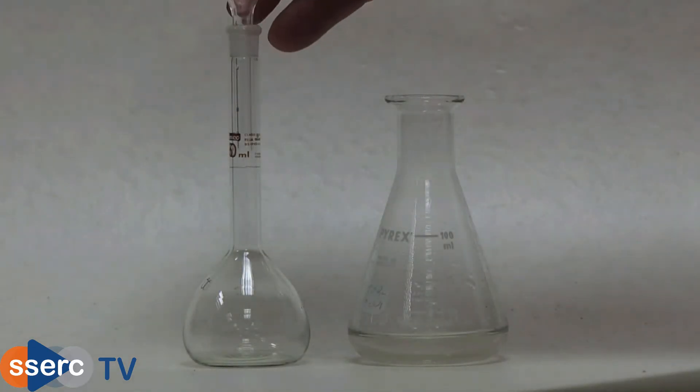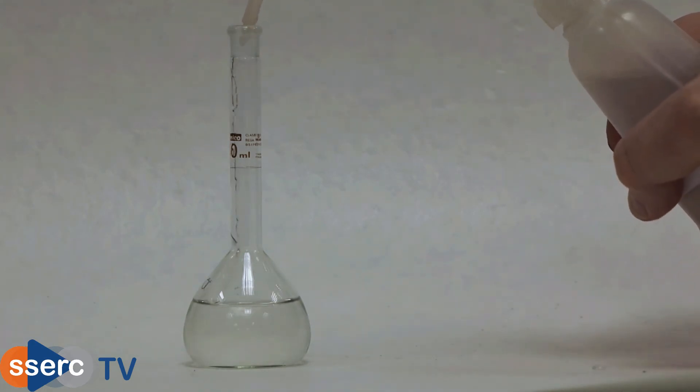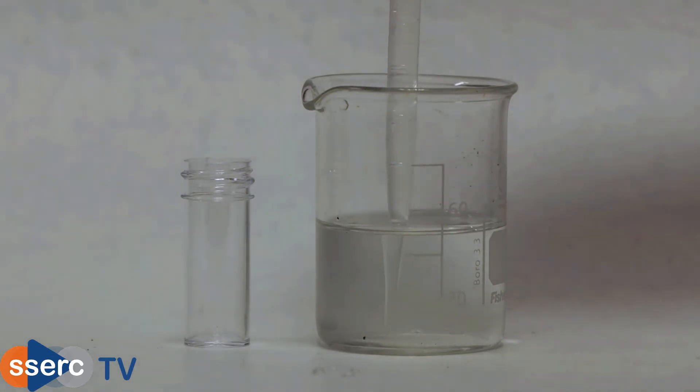Transfer your solution to a volumetric flask and make up to the mark. Once done, place a five cubic centimeter sample of your tea extract in a test tube or any other container ready for the test.